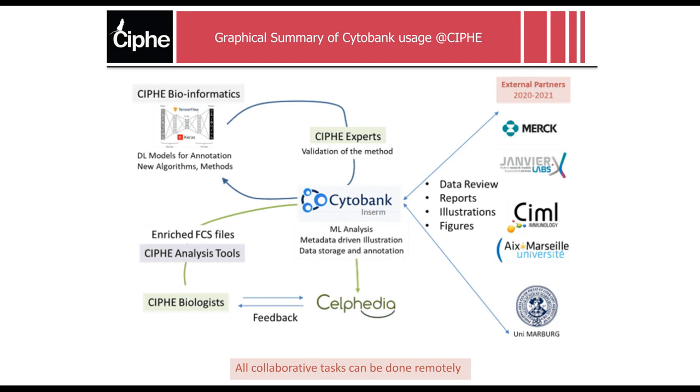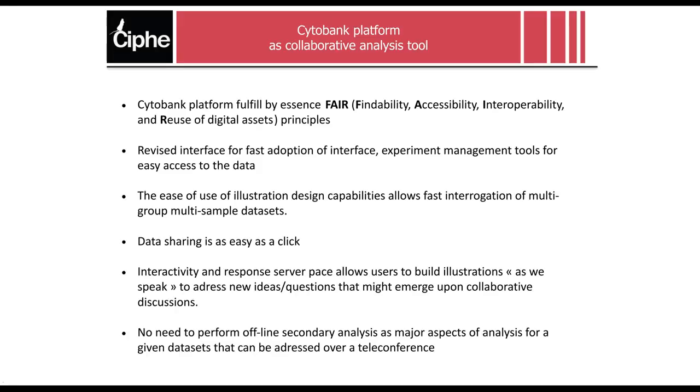And finally, here I've just listed a few of the ones that could actually benefit from our intensive use of Cytobank over this COVID sanitary crisis. So we were locked down, but data analysis was actually progressing thanks to Cytobank. We could do data review, we could do reports, we could generate illustrations and figures for papers, and so on. So that did not stop us working, basically, thanks to this cloud-based solution.